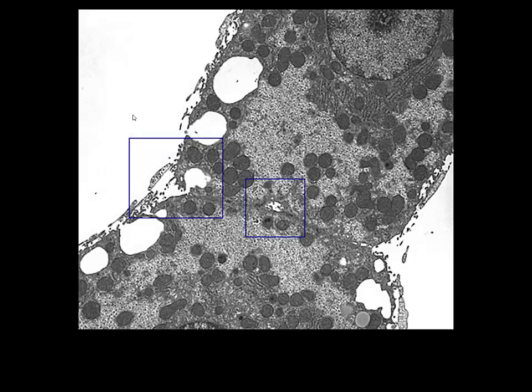Now, we've seen this image in lecture. This is our sinusoidal type of endothelium. This is present in the liver. Here we have two liver cells, tons of mitochondria, some rough endoplasmic reticulum here, and the nucleus at this point. And then here we have our discontinuous endothelium. It looks like it's just shredded, but remember there are such large holes present in these membranes that it's going to give us this appearance in a cross section. So this is our sinusoidal endothelium.